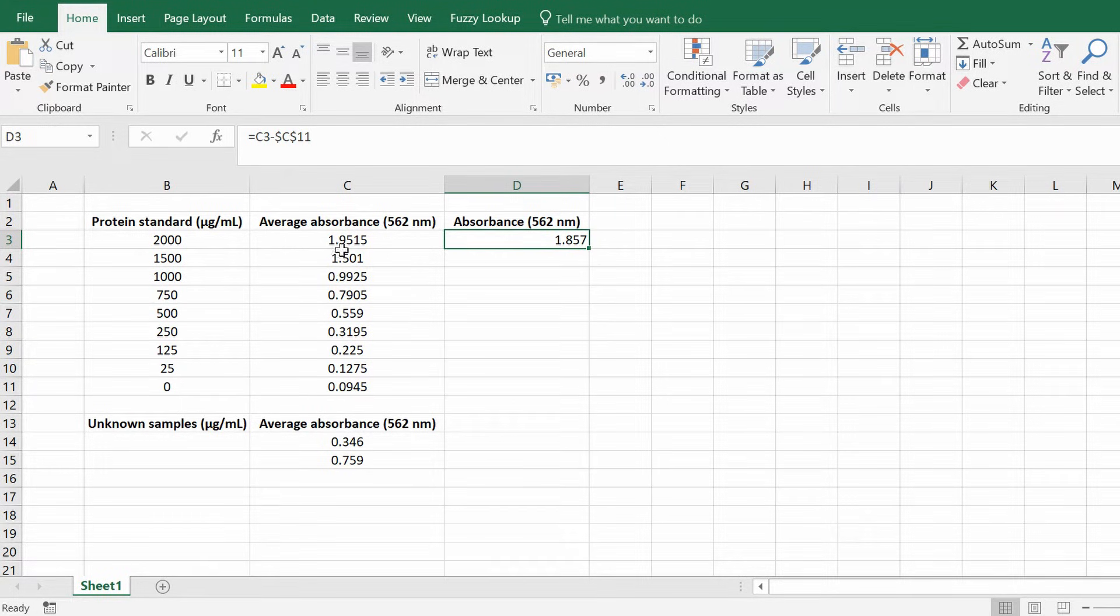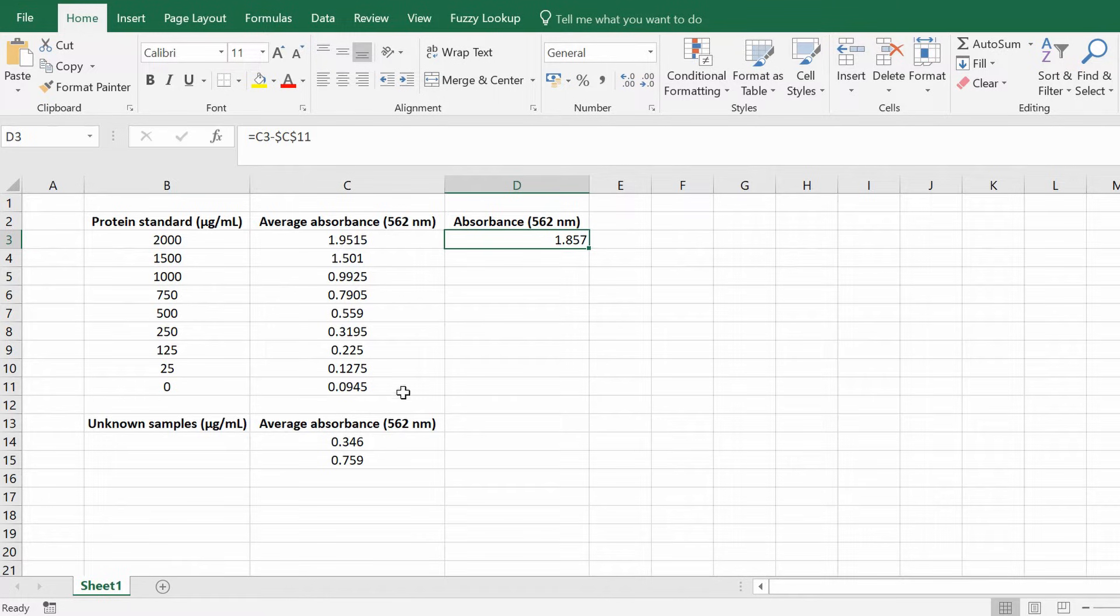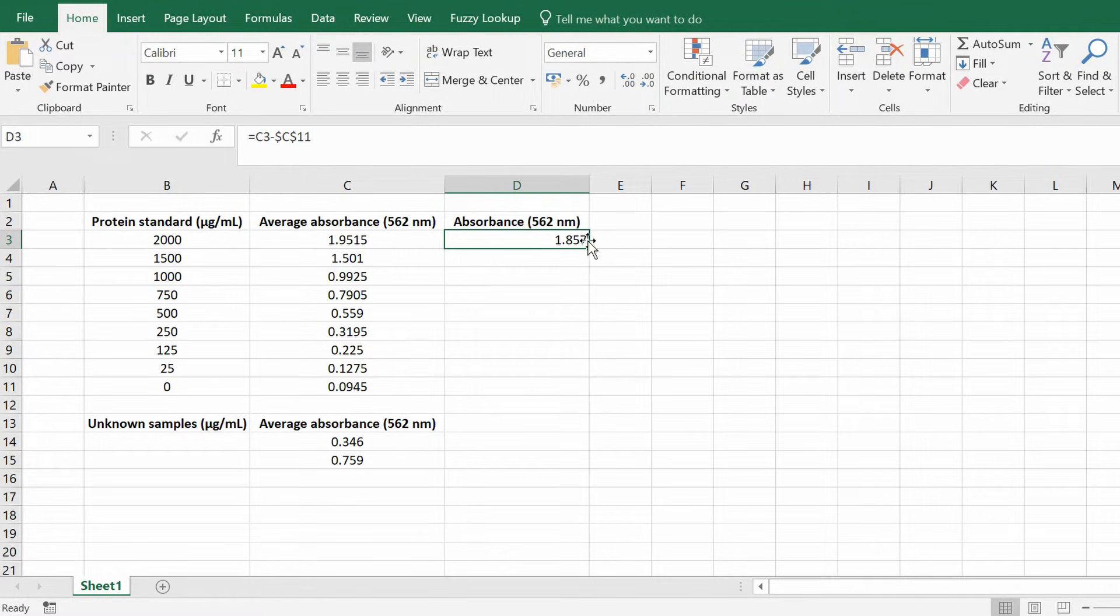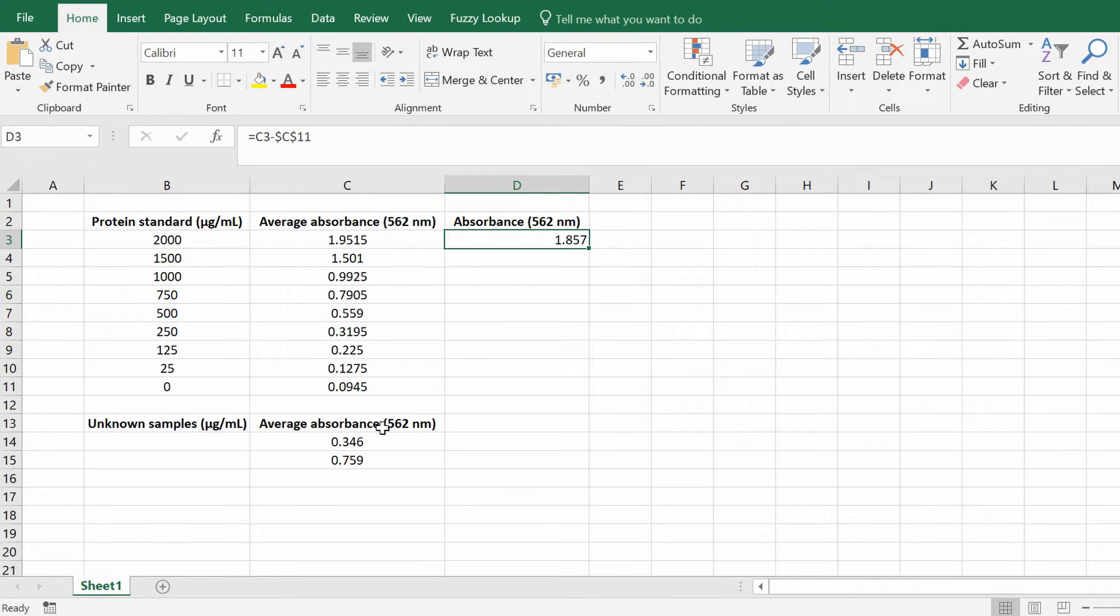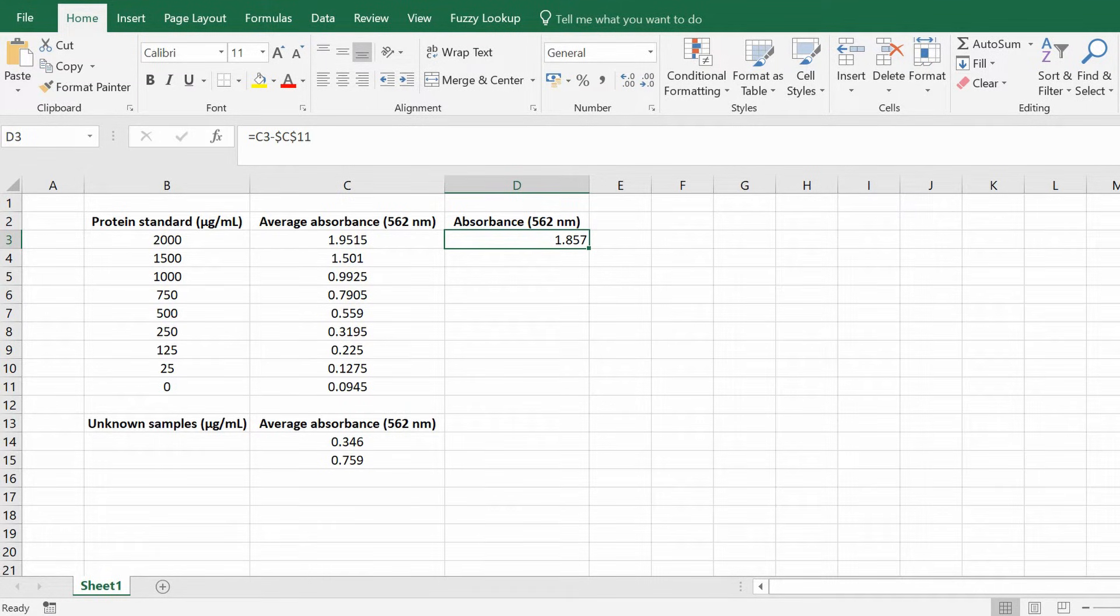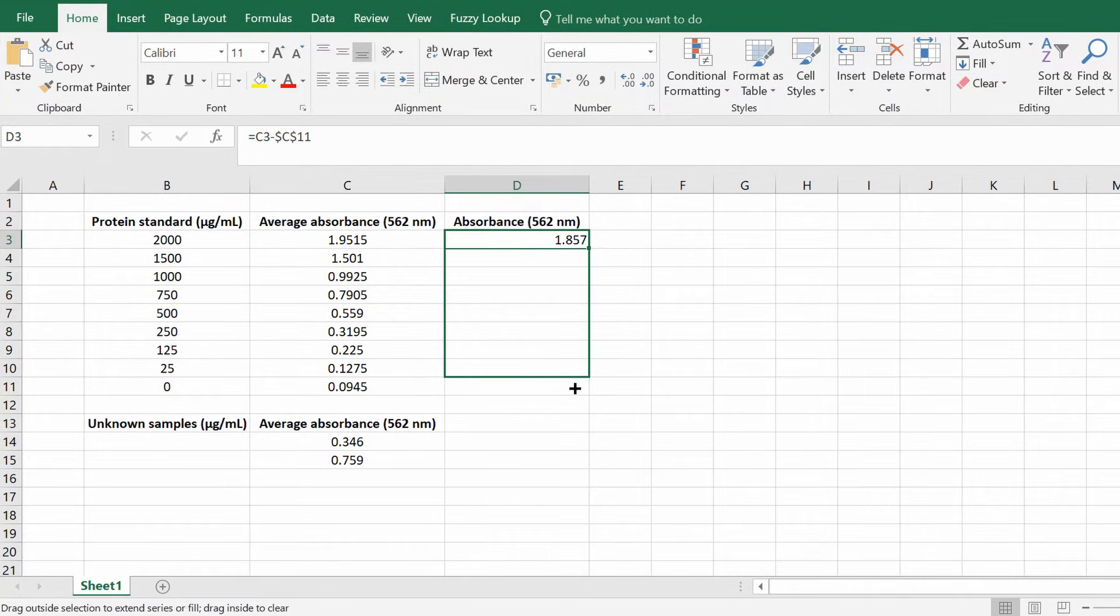So you'll notice now that the first standard has been background corrected. The reason why I said to insert these dollar signs is because what it'll do is we want to keep this cell constant. If you use Excel's drag function to drag the formula down, usually it'll incorporate a sequence so instead of being C11 it'll then be C12, C13, etc. But by inserting these dollar signs in the formula, we can keep this cell constant.